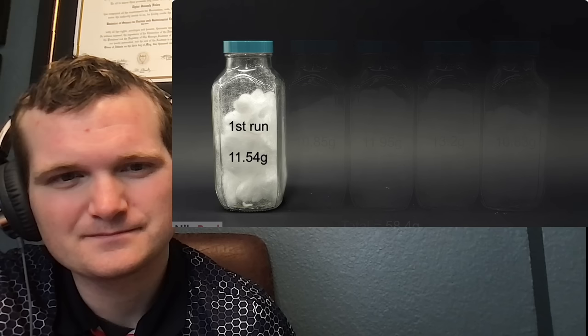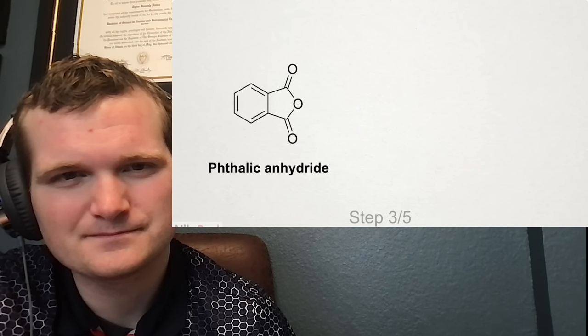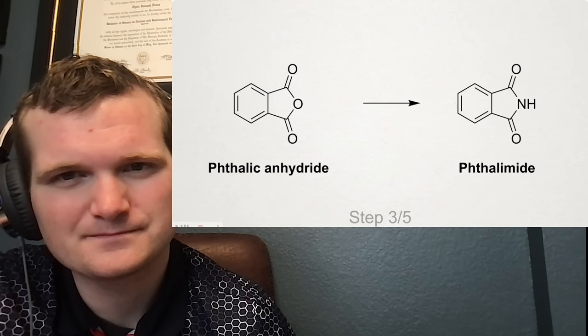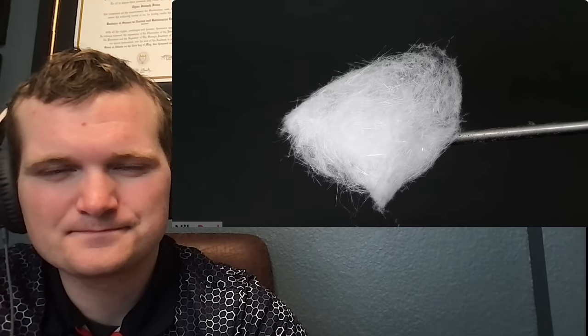The next thing to do was turn all of this phthalic anhydride into something called phthalimide. To make this happen, the first step was to compress the puffballs, because right now they were mostly air. I did this by stabbing them and mixing them around for every bottle. When I was done, it was still mostly air, but significantly better than before.